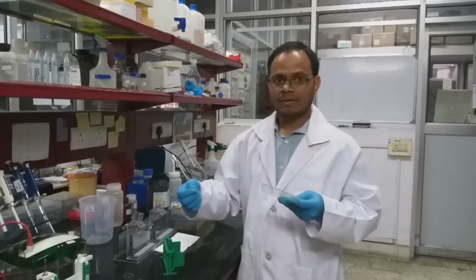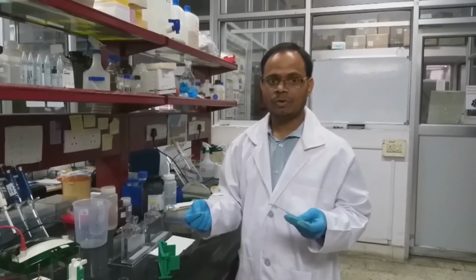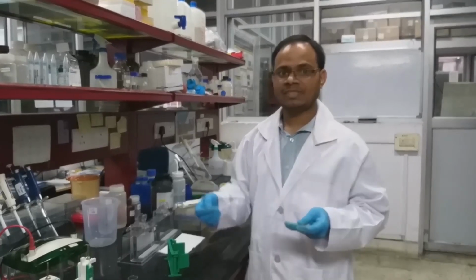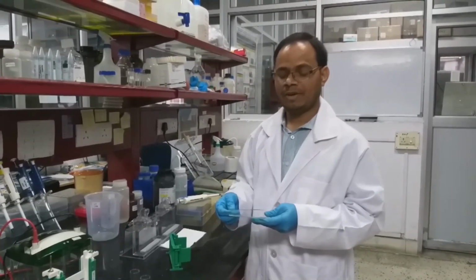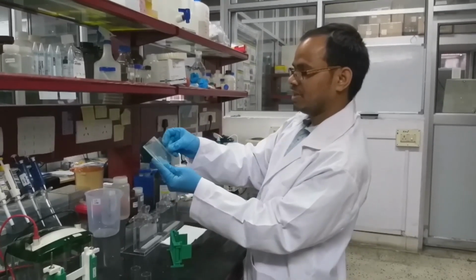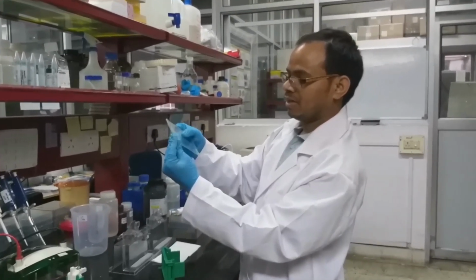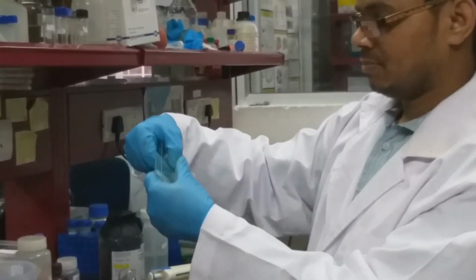If your loading solution is less, like you want to load only 20 microliter, 30 microliter, then 1 mm gel is good enough. But if you have extended volumes like 70 microliter, you can use 1.5 mm gel. You have to arrange like this, short plates on this plate, and the bottoms should be equal.